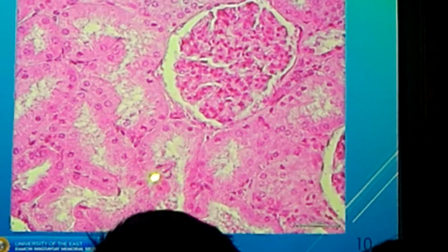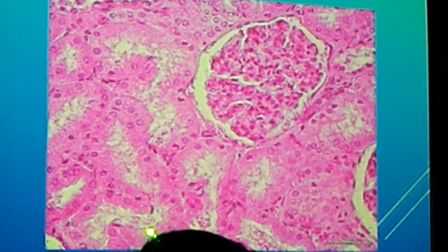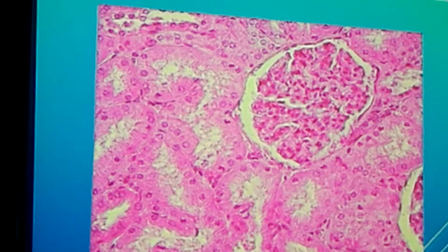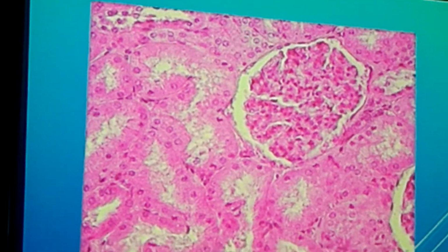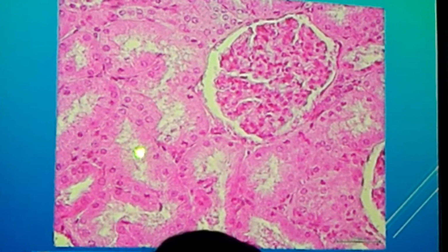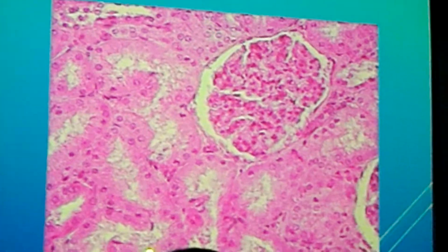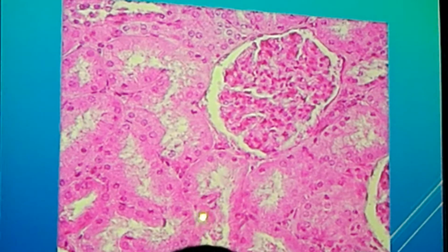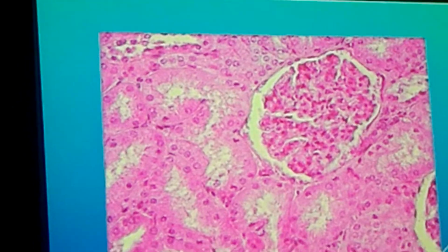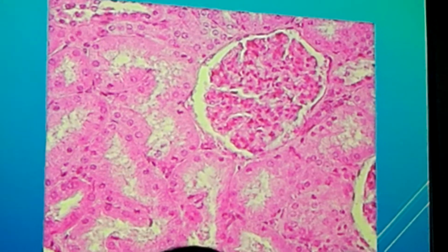And then outside, you will have this proximal and distal tubules. For now, ang difference nila, the proximal would have a hazy lumen. And this is because of the presence of the brush border, which are actually microvilli. So this is your proximal convoluted tubule in reference to your glomerulus, proximal, simple cuboidal with brush border. Yung mga clear, that's distal, away from your glomerulus, so it's simple cuboidal epithelium without brush border.